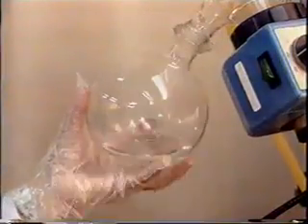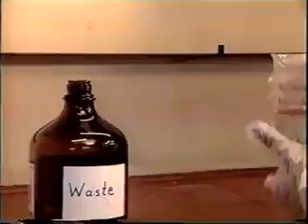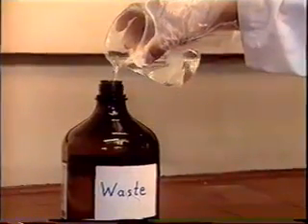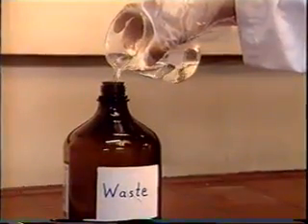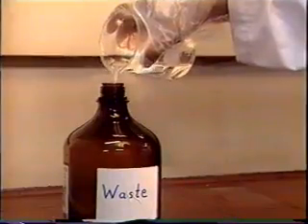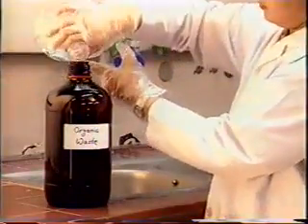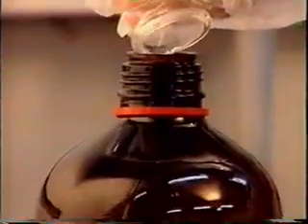Every chemical experiment leaves laboratory waste. Some of these wastes are incompatible with each other and may lead to vigorous reactions or the development of toxic fumes. Always inform yourself about the proper way of disposing of your chemical waste.